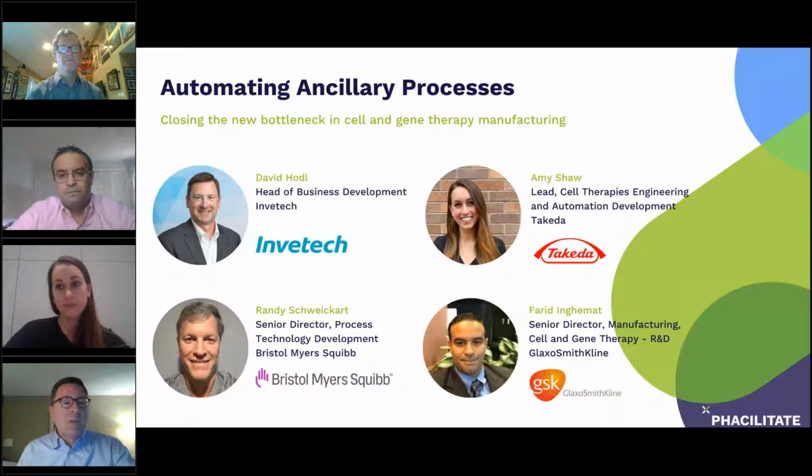Okay, and Amy, how does Takeda define ancillary systems? Yeah, absolutely. I couldn't agree with Randy more. I think for us, focusing on the cell therapy aspect, regardless of whether it's allogeneic or autologous, anything that's outside of those initial cells and being added into those cells, we would consider ancillary. So while they could be core processes on their own, what we're bringing into the cell therapy process is considered ancillary.